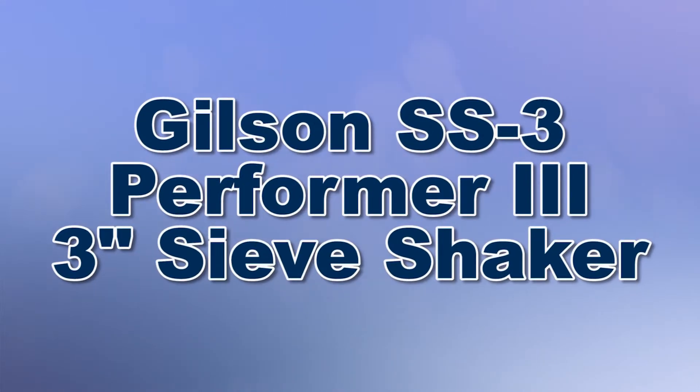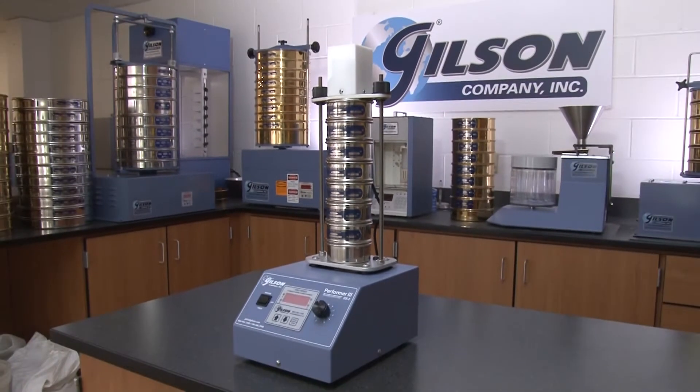When your testing lab needs to perform accurate sieve analysis of fine particles, Gilson is your choice for sieve shakers.